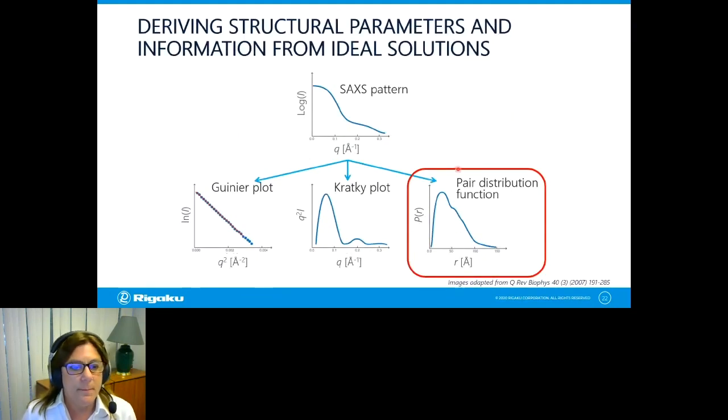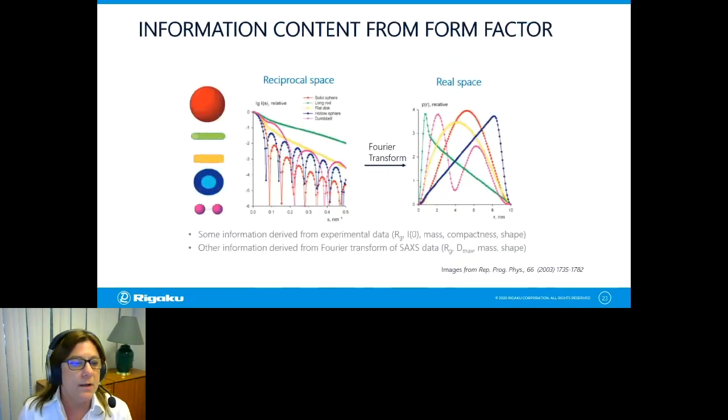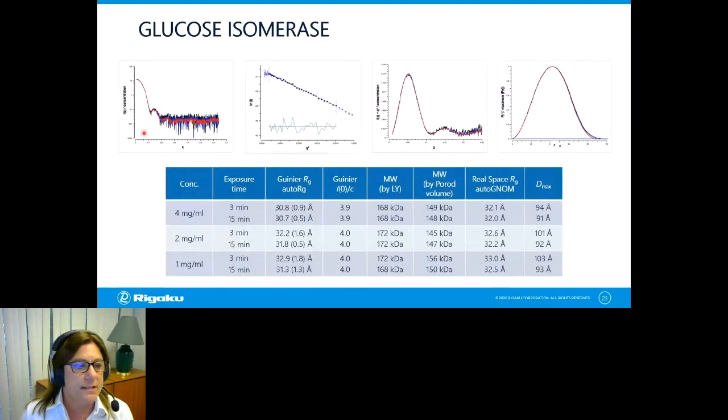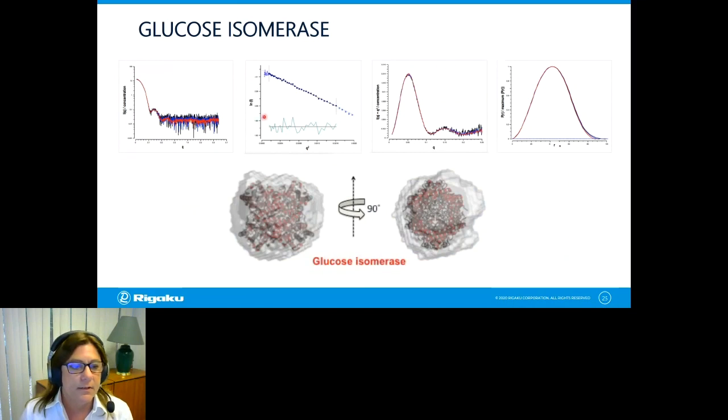Additionally, what you can do is a pair distance distribution function. And basically what that does is it gets you from reciprocal space to real space. So you can start to derive some models. All right, so we're going to quickly look at that for glucose isomerase. So here's a mixture of several scattering profiles. They perfectly overlay with a Guinier plot, a Kratky plot that shows it's folded. And we've done an inverse direct, indirect Fourier transform, and we can then calculate a model. So I've gone quickly through this, but it gives you an idea what you can do if you're working in that type of sample space.